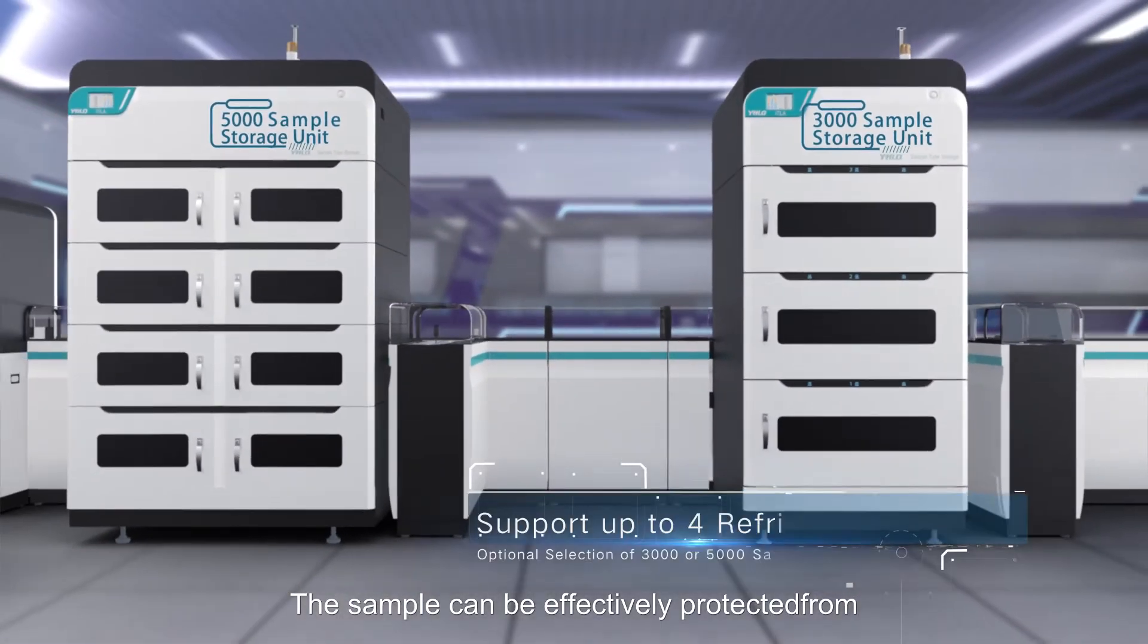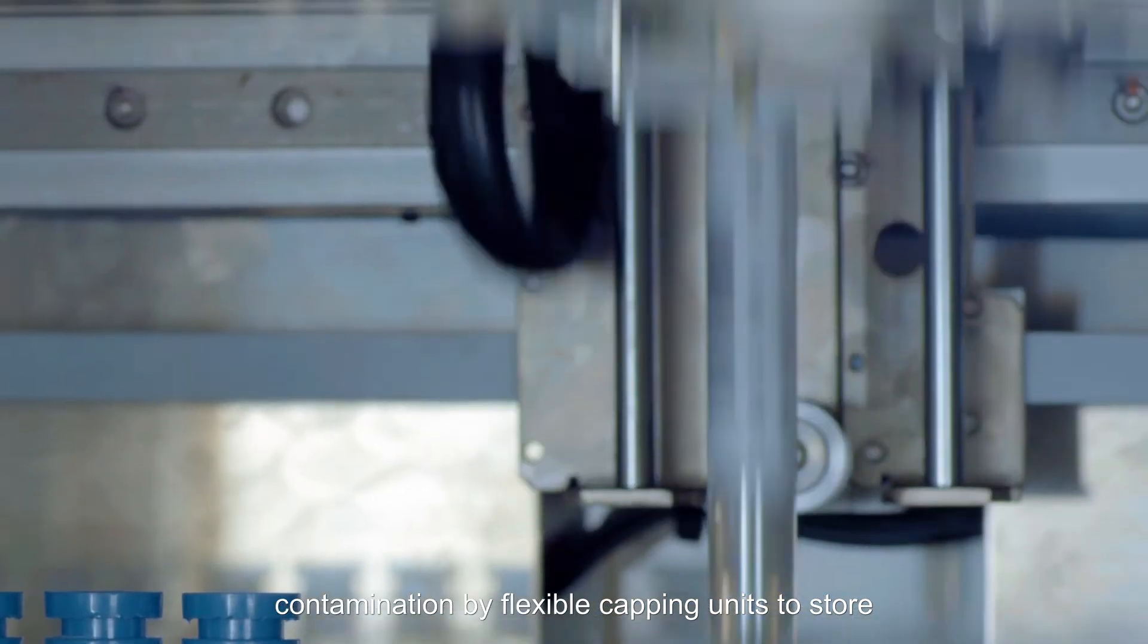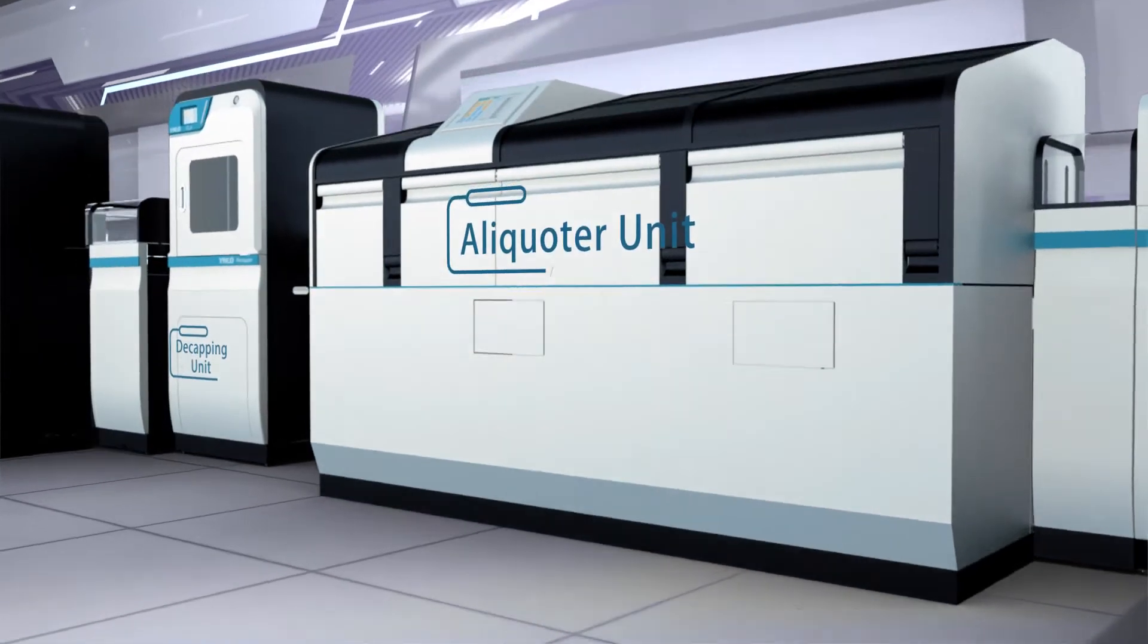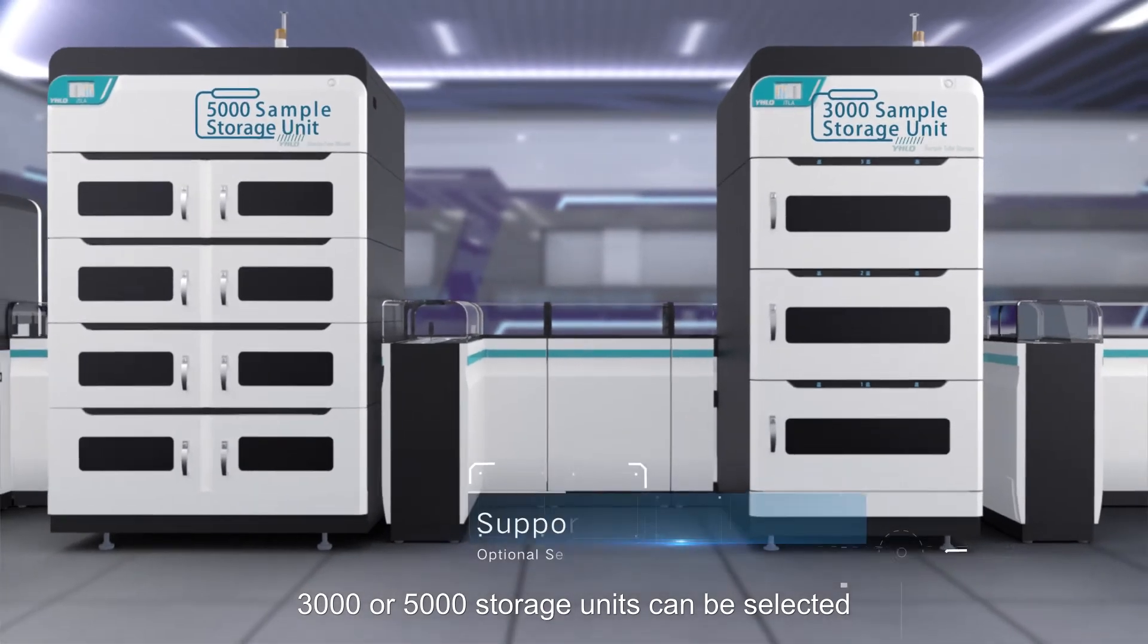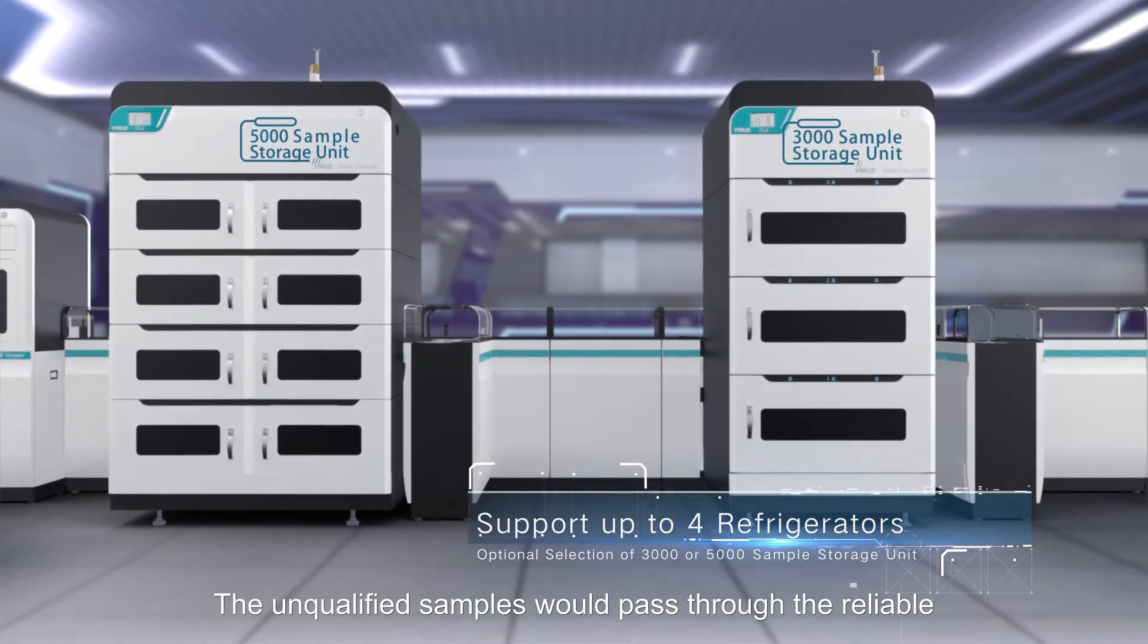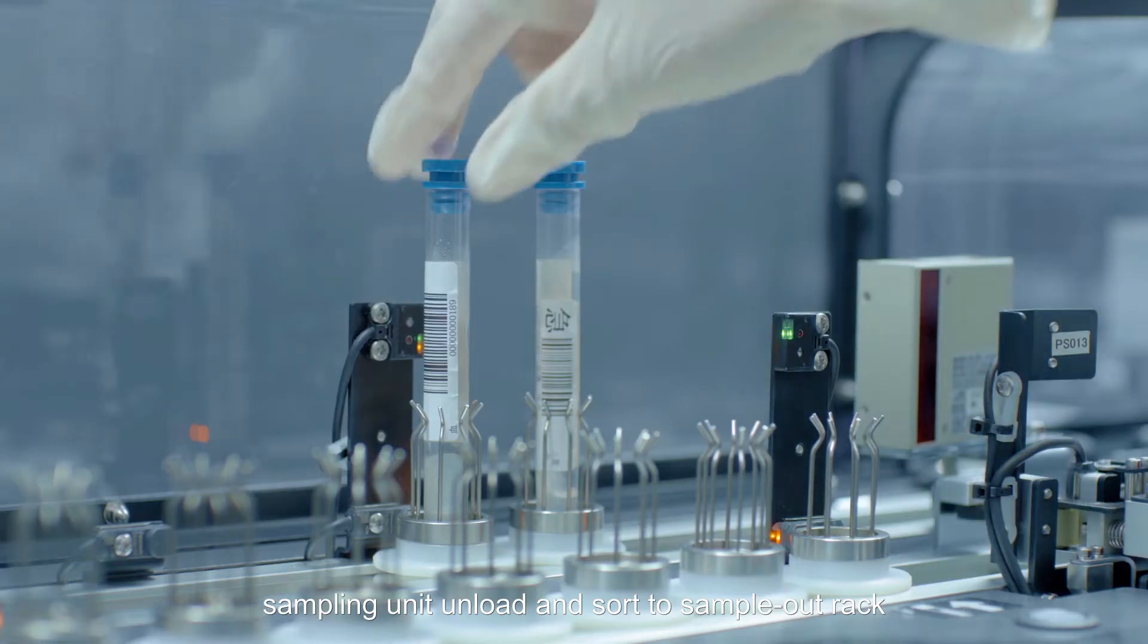The sample can be effectively protected from contamination by flexible capping units to store qualified samples into multifunctional storage units. 3,000 or 5,000 storage units can be selected according to requirements. The unqualified samples would pass through the reliable sampling unit, unload and sort to sample out rack.